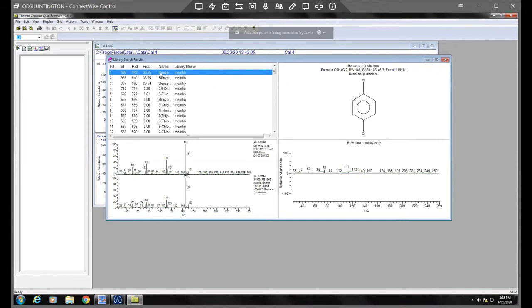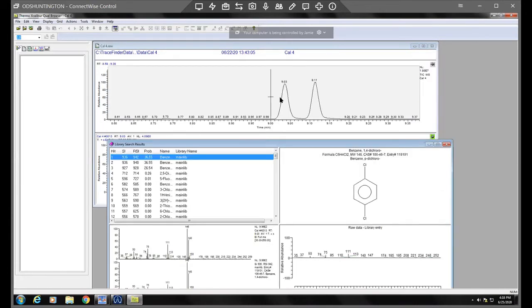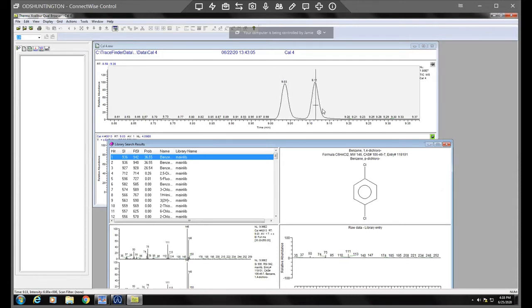So that makes sense. So the one four is the 9.03 retention time and the one three was the 9.11.